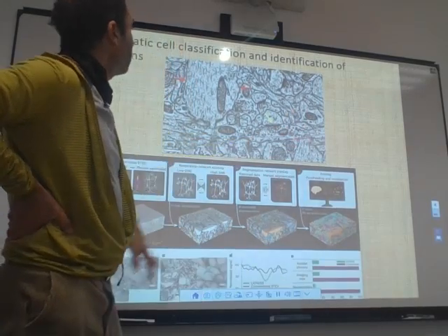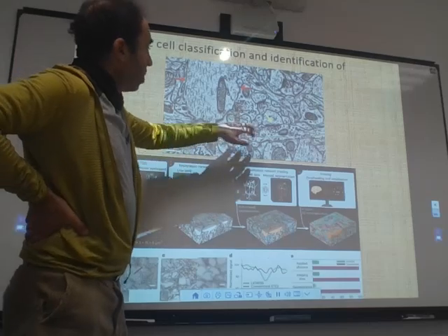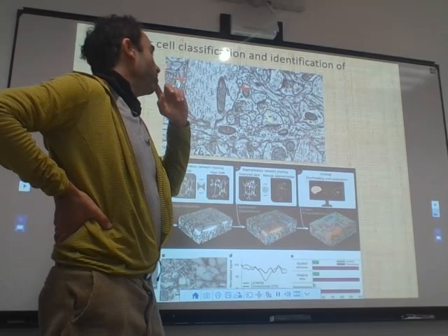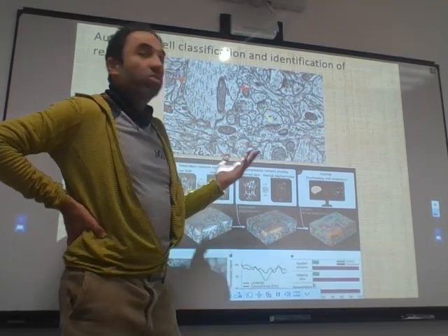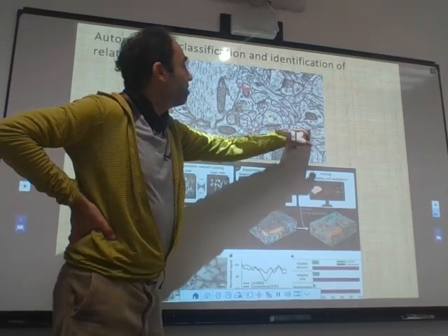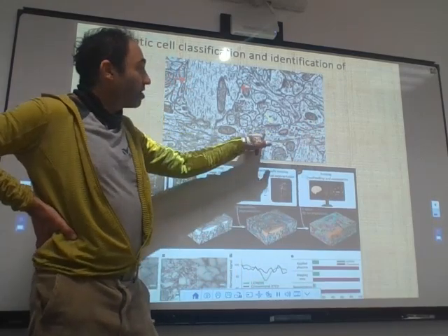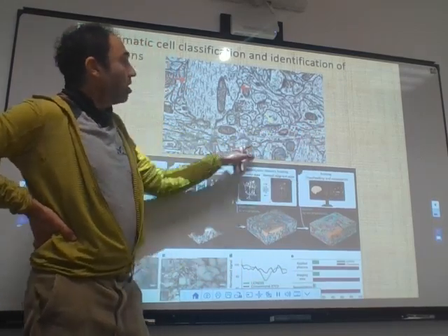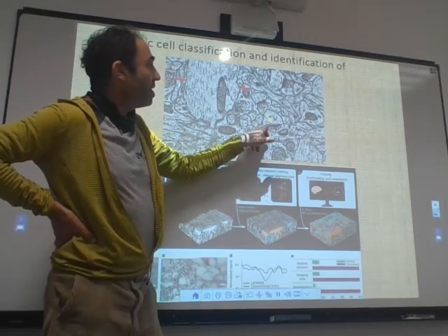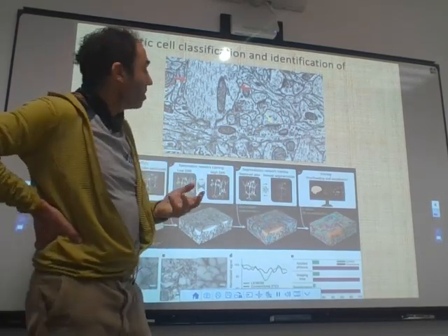This is mitochondria, and you are interested in, from those images, for example, counting the synapses. So if you want to do some kind of machine learning approach, you would say, all right, if I have vesicles, it's not that the synapse is big like this, although you can have clustering. So I have some cluster, that's true, but to identify the synapse, you need the cluster, you need the membrane, and you need this black, dense postsynaptic density.